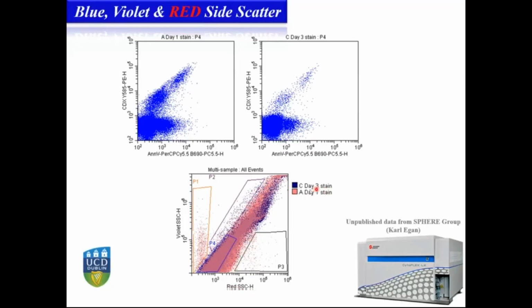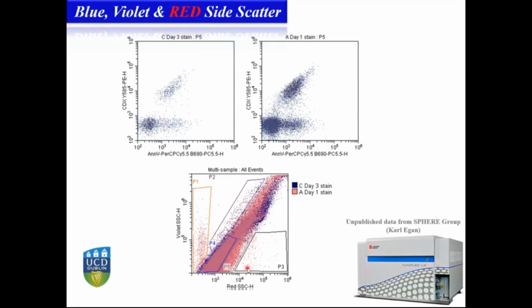Now, if I move to this section here with high or higher red side scatter, that looks like on day 3 is gone, or practically not present, what will happen? Look, that population is highly present, or has high expression of this CD marker. Okay, it's quite interesting. Here is the same. Most interesting is when we compare to this other population, population 4, that has less red side scatter.